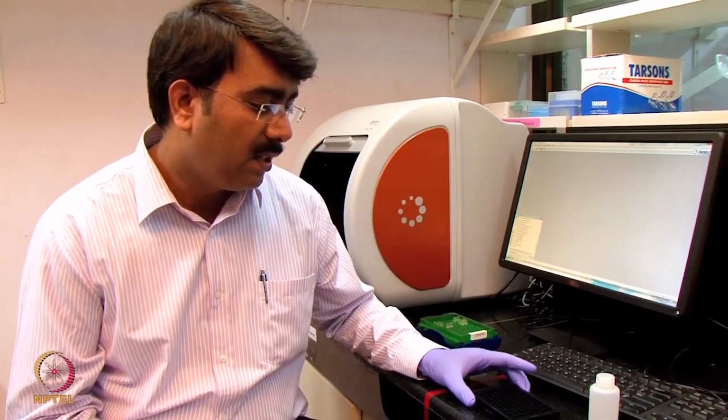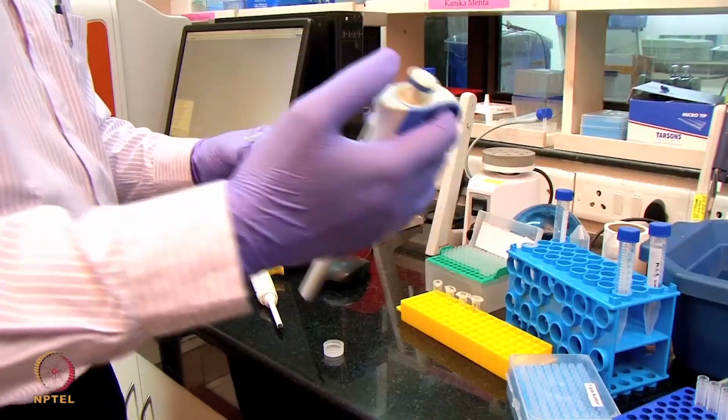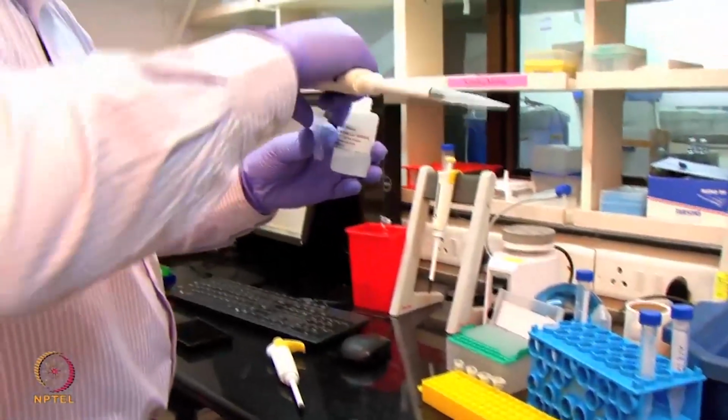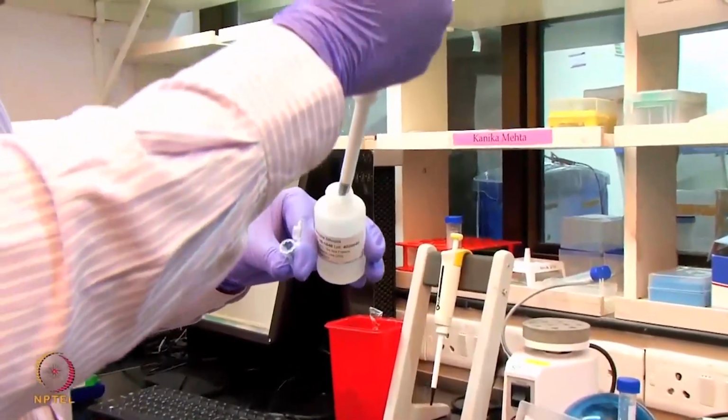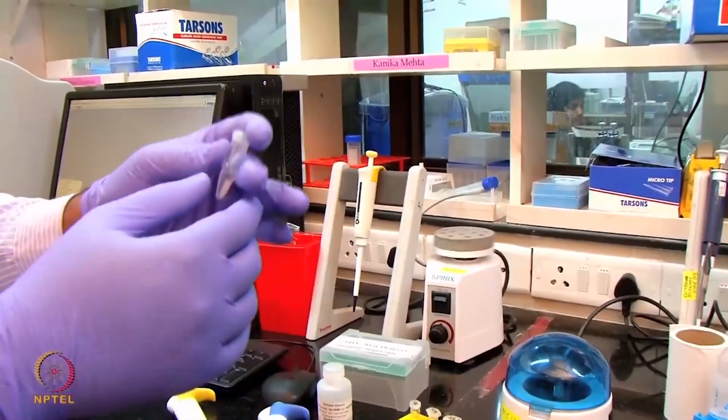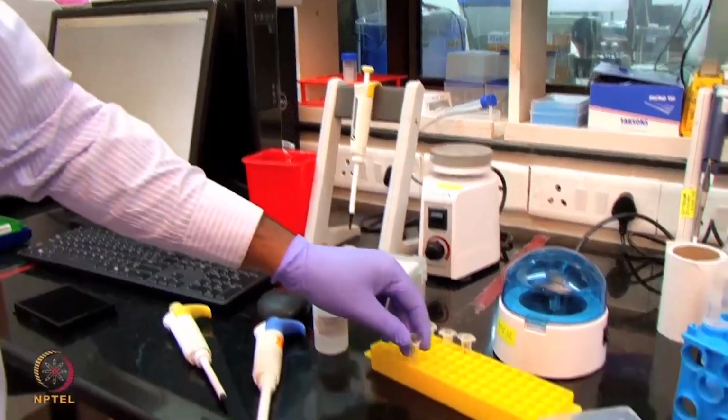We are going to do a quantitation of the apolipoprotein. In the previous step, we immobilized the biotinylated antibody onto the streptavidin sensor. Now we can do the quantitation using that sensor. It's pre-immobilized. So I am making an apolipoprotein standard with a concentration of 50 microgram per ml. I'm going to dilute the apolipoprotein standard to 50 microgram per ml using the sample diluent. From this I'm going to do a serial dilution, a two-fold dilution, with the buffer.